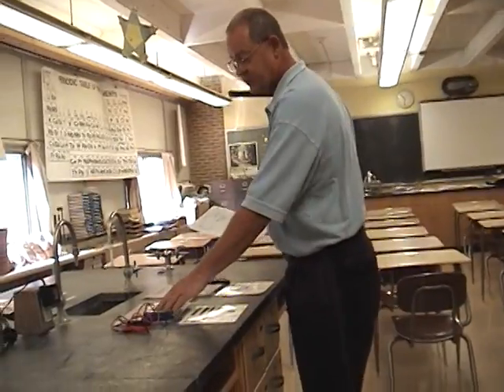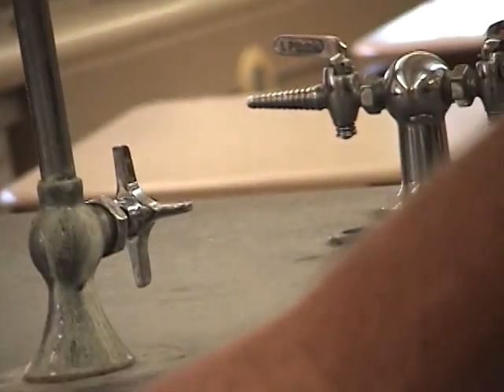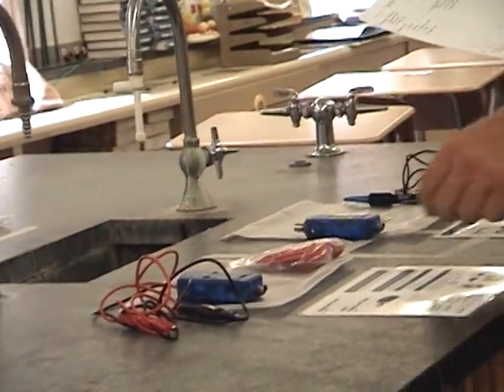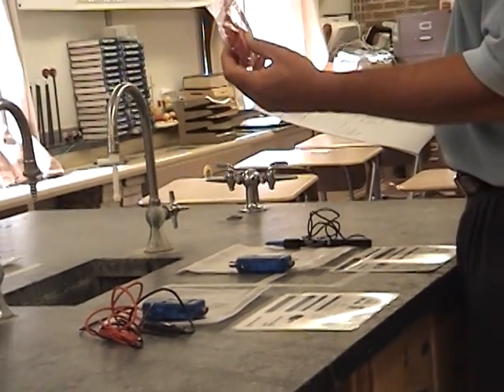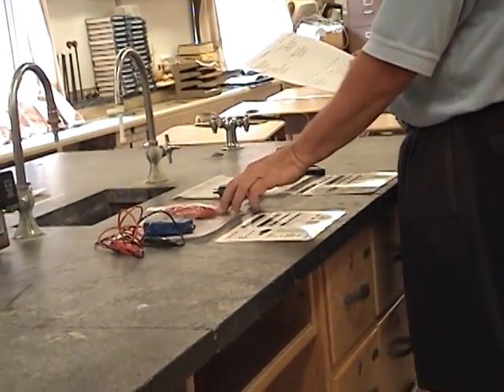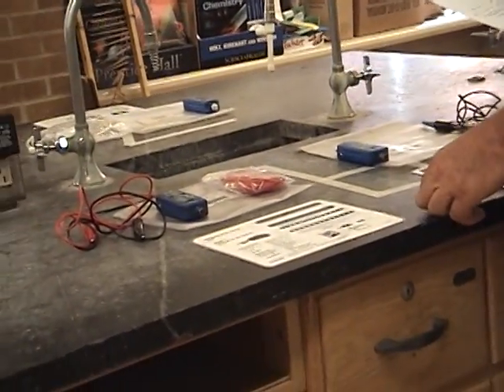That completes Drawer 5, the temperature and pH detection. We'll move on to Drawer 6, where we're going to look at current, voltage, and conductivity. Electrons and ions can move, and we call that flow electricity, whether it's in a wire circuit or in a liquid. When we're measuring things in wires, we use the voltage amperage sensor pack, and this is our voltage amperage current sensor. It has its own electrodes with alligator clips and contacts built in permanently. We also have an alligator clip pack that can be used for extra measurement or extending the measurement. There are two instructional cards that go with the voltage current sensor for quick start and setup.